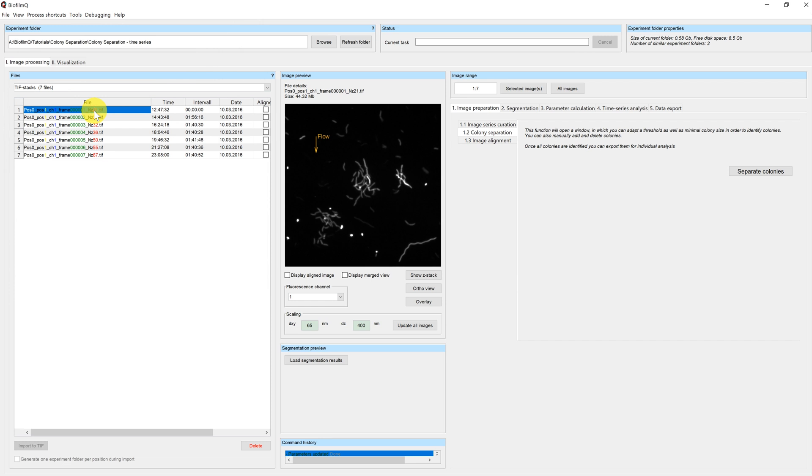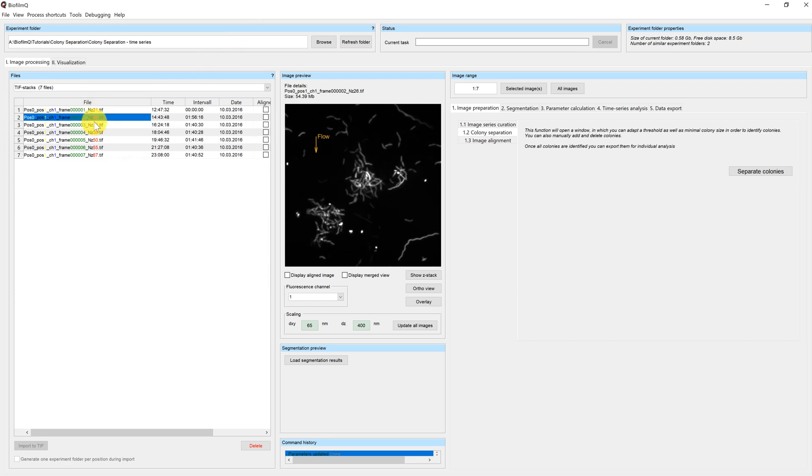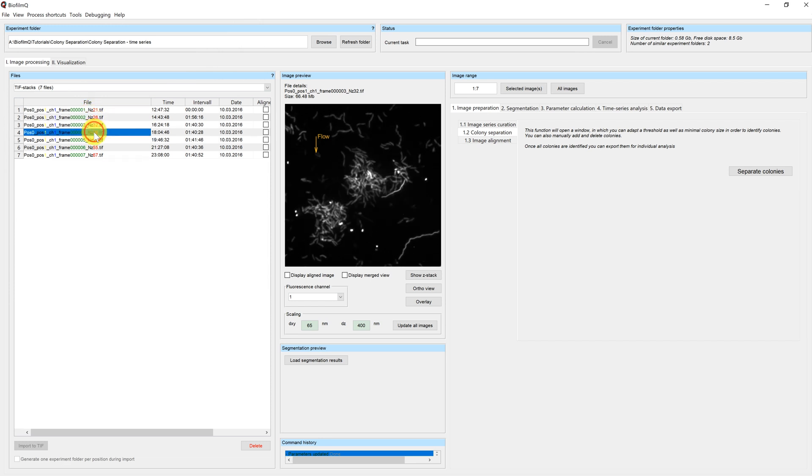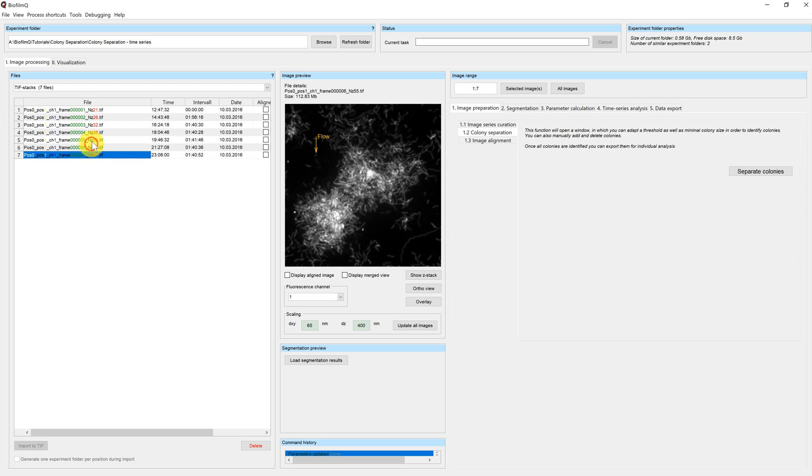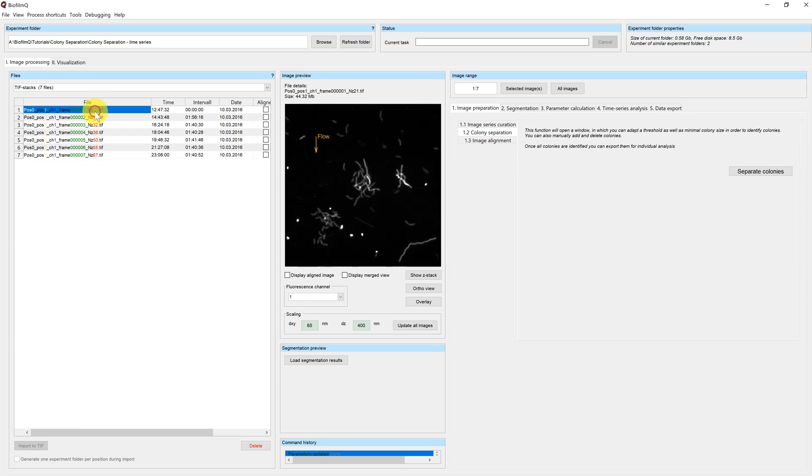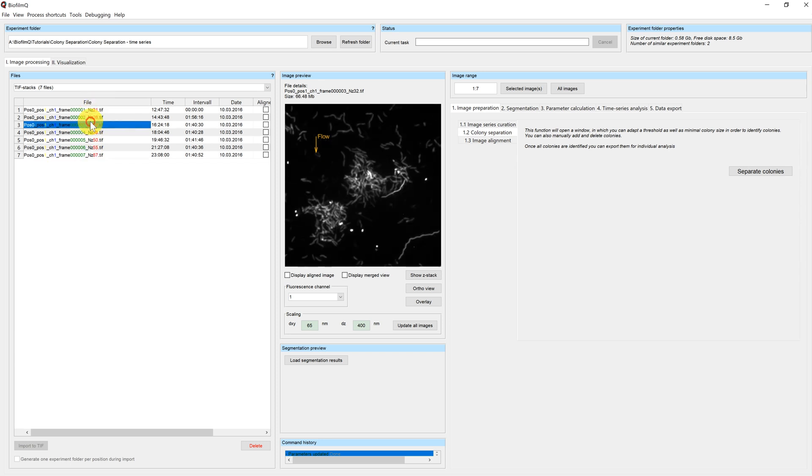In this directory, I have the example data we already used in our other tutorials. You can see two microcolonies growing next to each other.